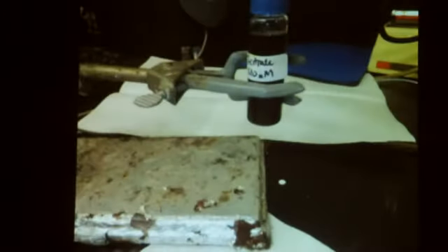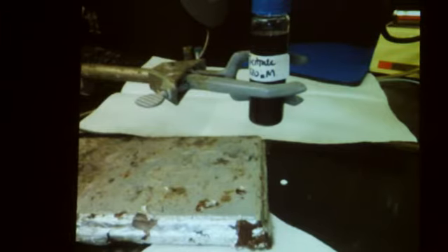Okay, and then in order to get our sample of the titanium citrate, we carefully lift the lid off of the bottle, just a very small amount so we can get the needle in, because we don't want the oxygen to get in. And we use the syringe to suck up 250 microliters of titanium-3 citrate. And then we put the lid back on and just let the bottle sit for a few minutes with the nitrogen flowing through. So if any oxygen did get in, it helps it to get out. And we also found that using a clamp for this part with the bottle of the titanium citrate, it was a lot easier than trying to hold on to it.